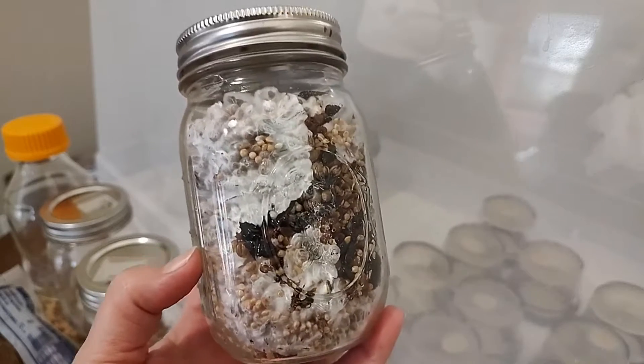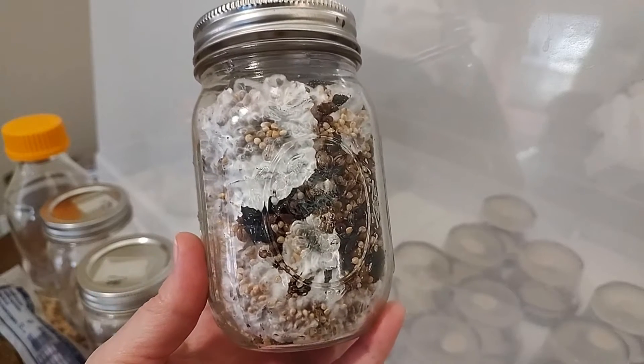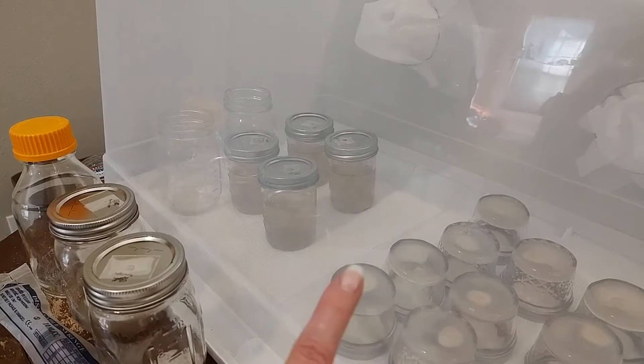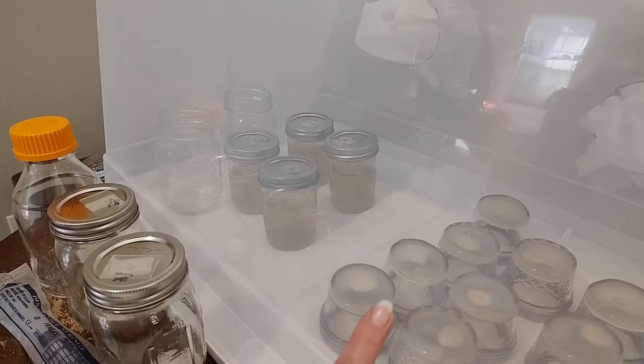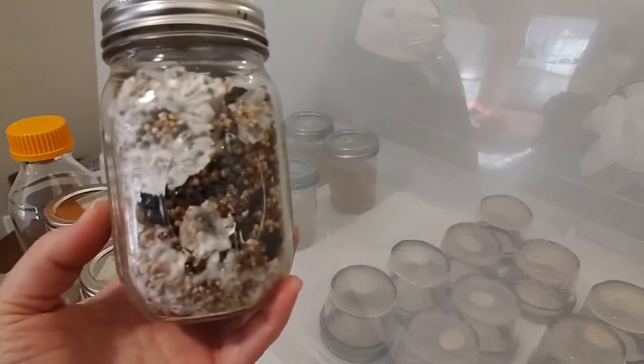When you're working with agar, liquid cultures, or slurries, you're working with mycelium. Here in these agar dishes in my SAB — the still air box — this is mycelium. No spores going on here.